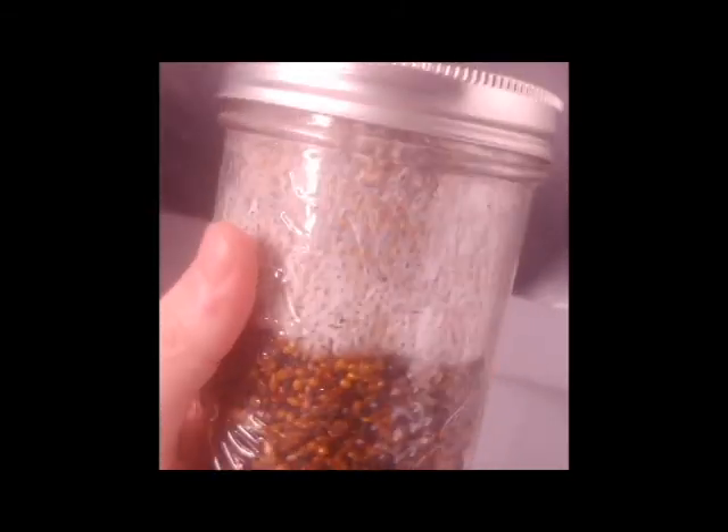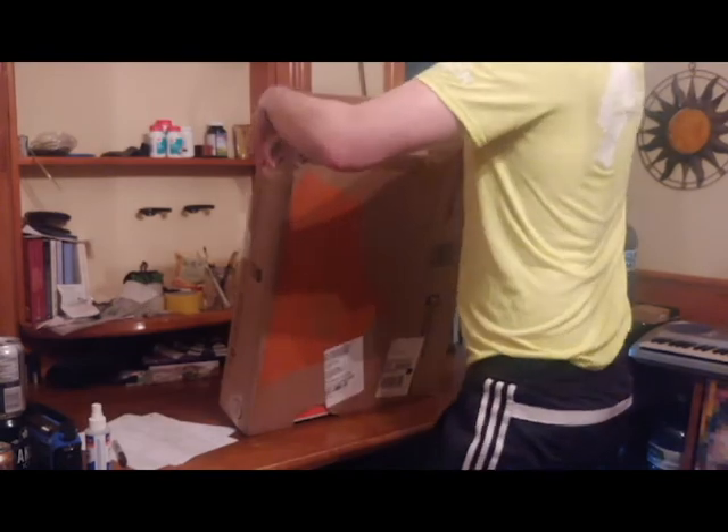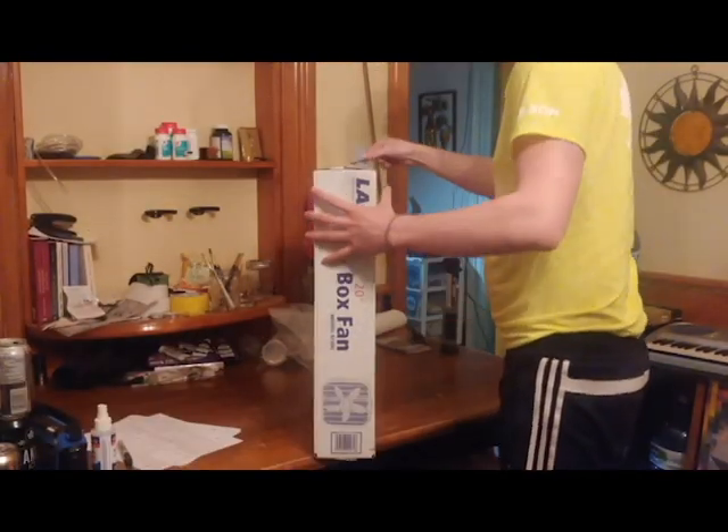Hello, welcome to my video. Today I'm going to be making a poor man's flow hood out of a 20 inch box fan. The box fan I got was Lasko's 20 inch box fan.